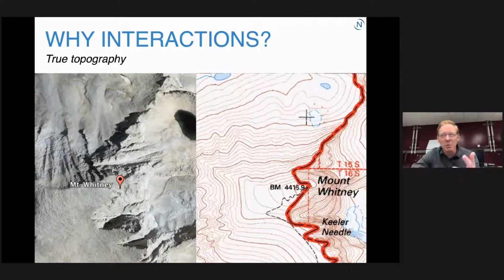And this is incredibly important when you have materials like graphene, for example, which is another Nobel Prize winning material development, where the thickness of the material itself is governing of its properties. None of these other techniques that I've mentioned so far give you that true information in the Z direction, about how thick and how rough materials are. And that really matters in terms of a lot of types of properties. So this microscope, because it's moving through and on the surface of the physical object with nanoscale precision, gets you this information that you couldn't otherwise get.